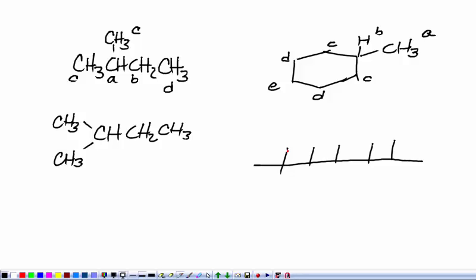That's what it means. I'm going to see 5 sets of peaks, each having a slightly different chemical shift. Now the reality is that they're all going to smush together, and then we have this small issue of splitting to deal with. Okay? So that's what the 5 means. It means there's 5 different chemical shifts that I'm going to see in the spectrum.